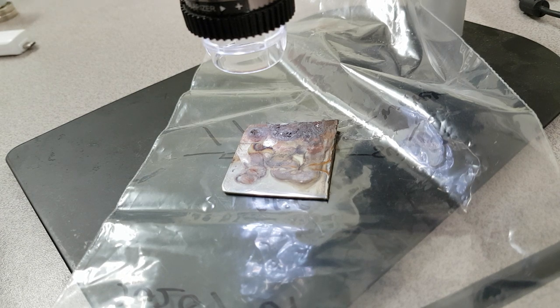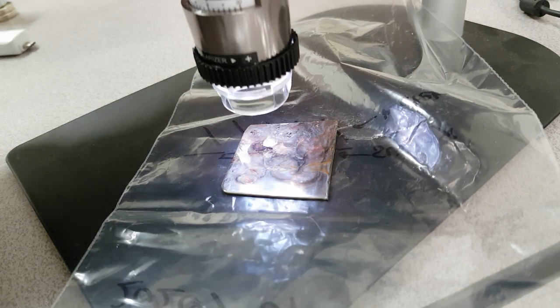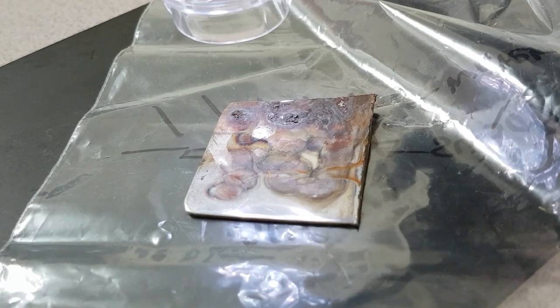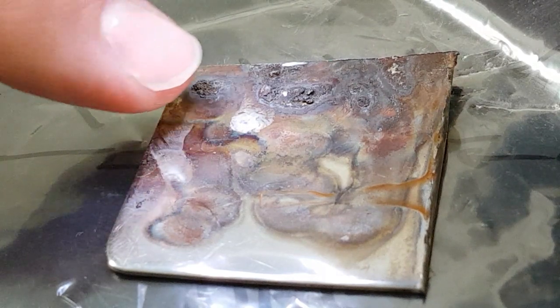I couldn't resist having a look at one — I just picked one and immediately saw something that made it impossible not to want to look at it under the microscope. What I saw were these things I call a yin-yang. I've seen these on Hutchison samples and other samples.